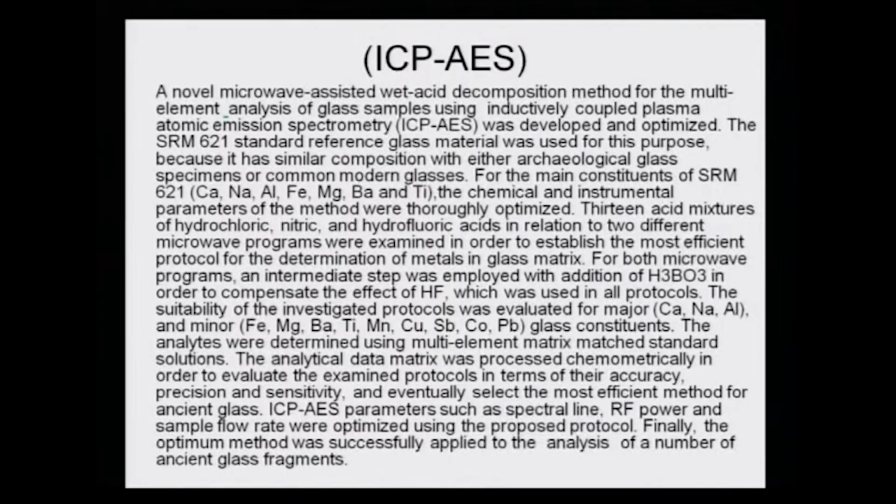A novel microwave assisted wet acid decomposition method for the multi-element analysis of glass samples using inductively coupled plasma atomic emission spectrometry, that is ICP-AES, was developed and optimized. So, now you see that in this particular method there is a special emphasis on use of microwave assisted acid digestion. Why?